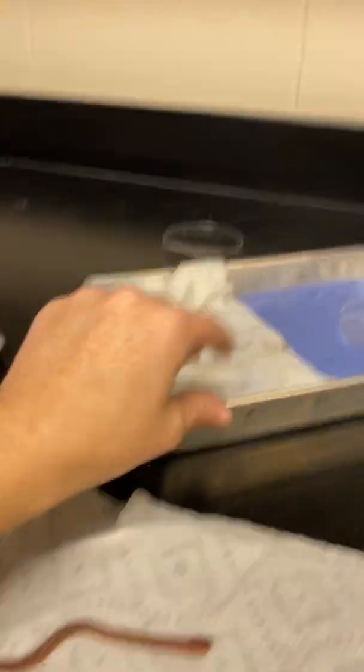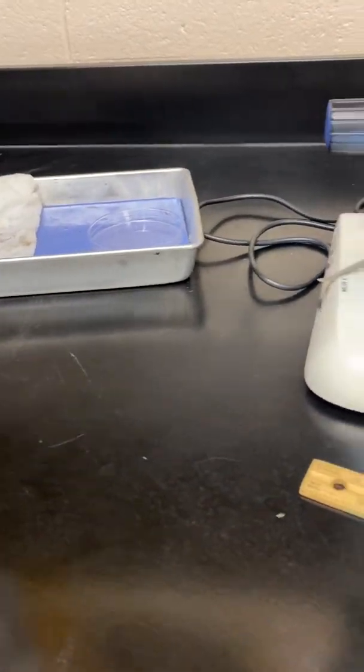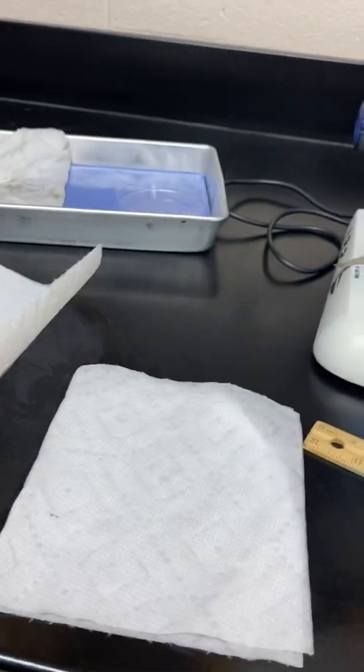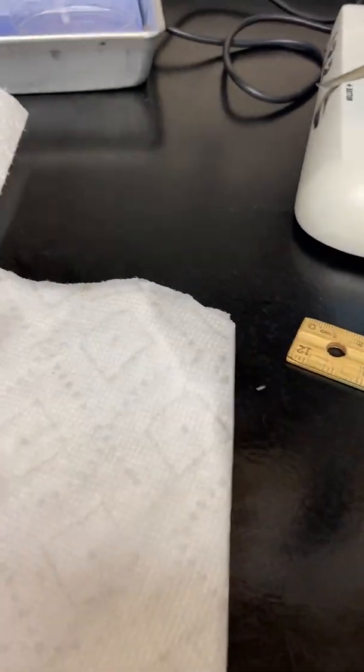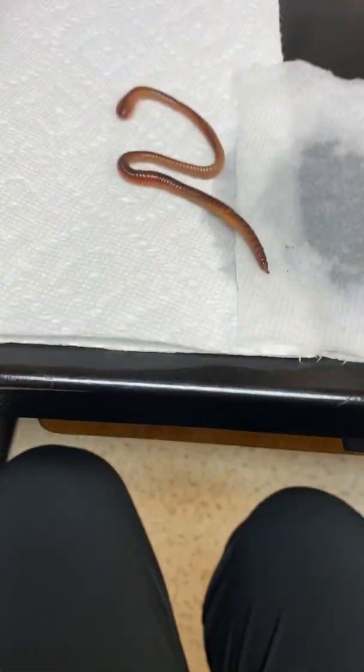They haven't really been cooperating much for this one. Get the water to make it a little bit more damp. So I'm going to put him, there's the head, in where the dry end is. Let's see if he moves over.